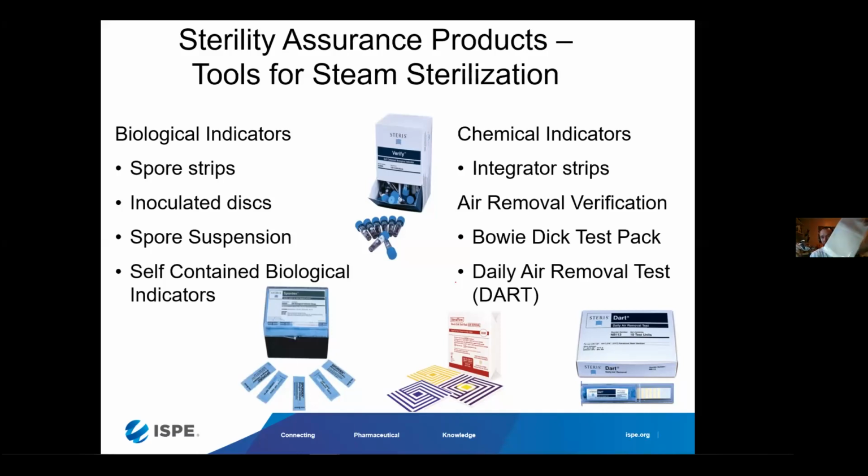You would have a sterilization wrapping. This is a Tyvek and film bag. The part would go into the bag. Prior to the sterilization, the bag then would be sealed up, and this is a very typical look at a bag with equipment probed and ready to go for your sterilization validation. You have the biological indicator at a worst case location adjacent with a thermocouple.